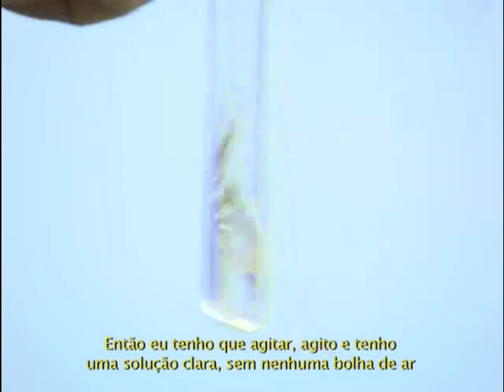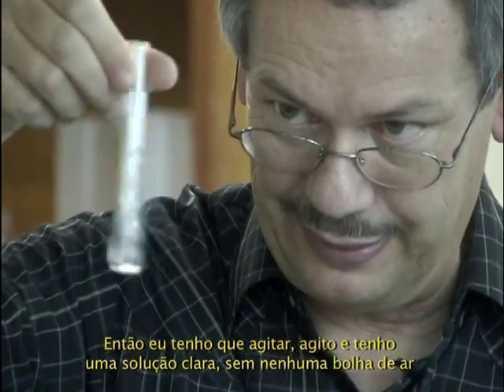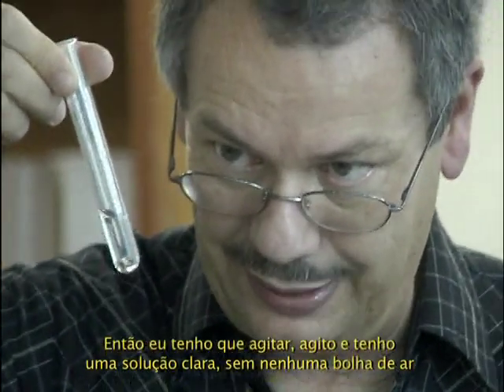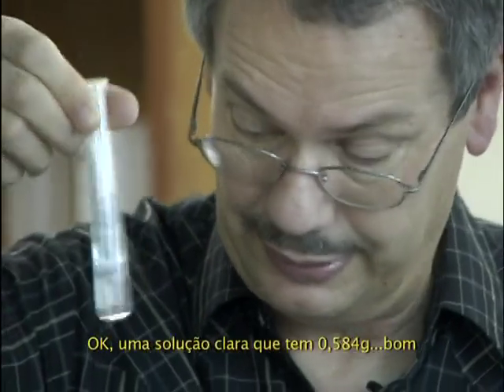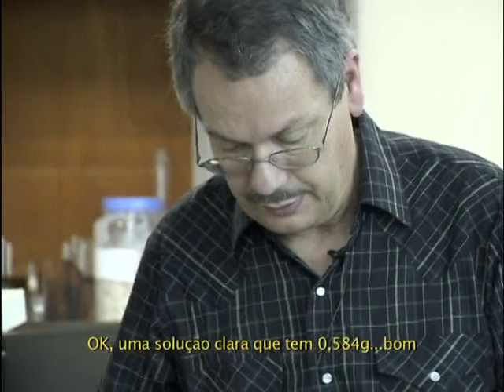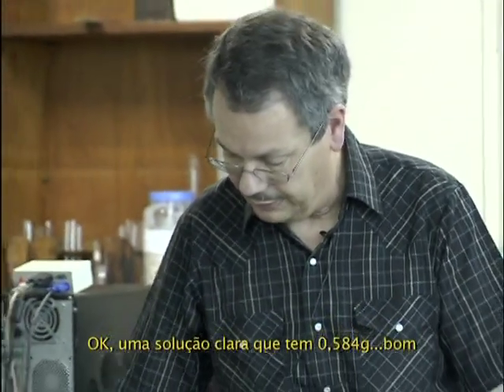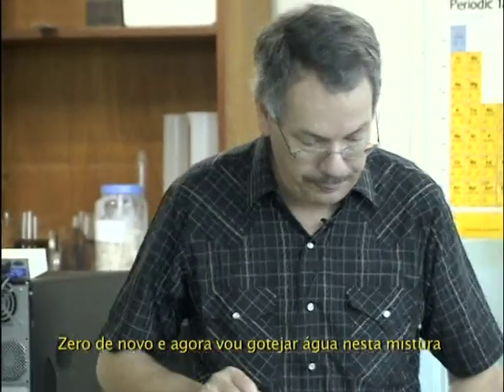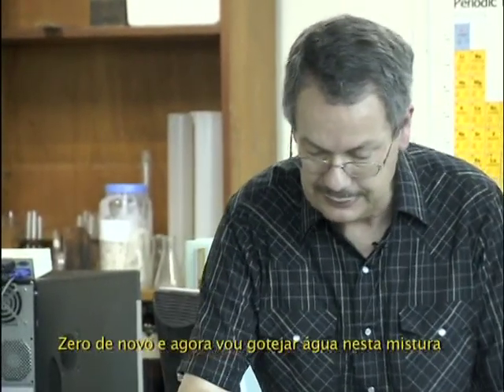I shake and I get a clear solution without any bubbles. Okay, clear solution which is 0.584. Good.